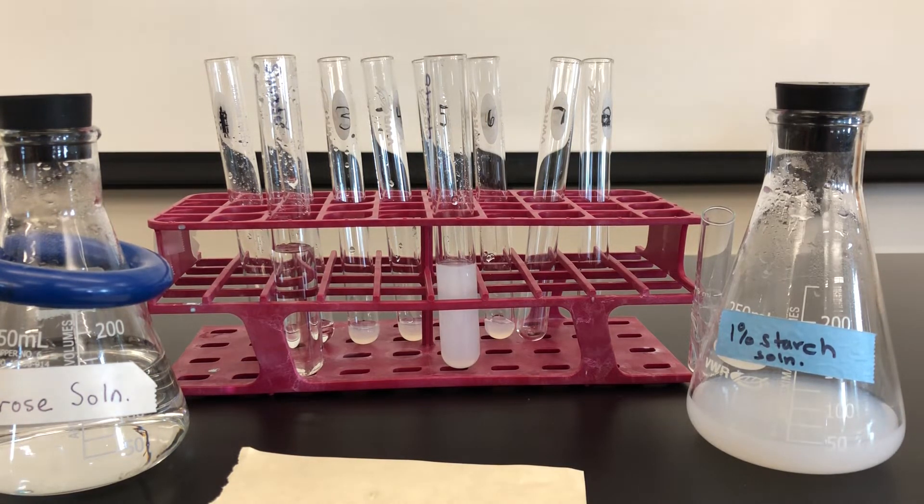We'll wait ten more minutes until we test the very last two test tubes, seven and eight. But a quick question: why might we be allowing for a longer period of time for the starch to be hydrolyzed, especially compared to the sucrose? Think about that one as we'll analyze our results in the next segment.